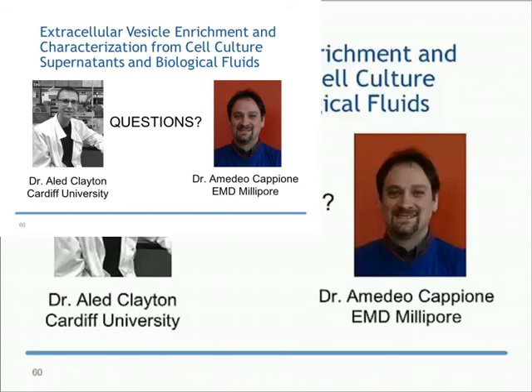So if you're trying to do this with, I guess, frozen tissue sections, you have less tissue material to work with initially, I think it's going to be a real challenge. But crikey, if you do crack that, that would be a very useful innovation, and I'd love to hear how you do it.